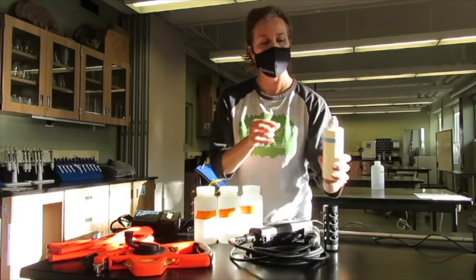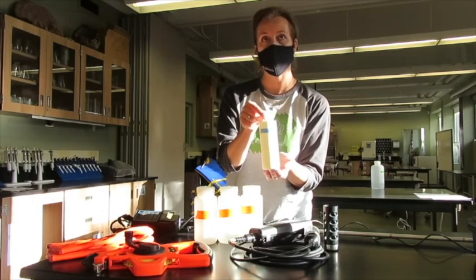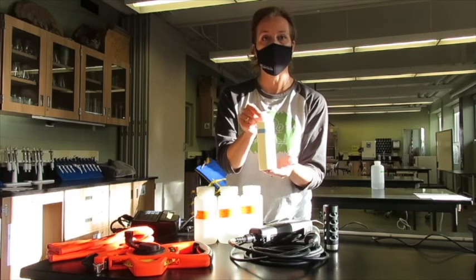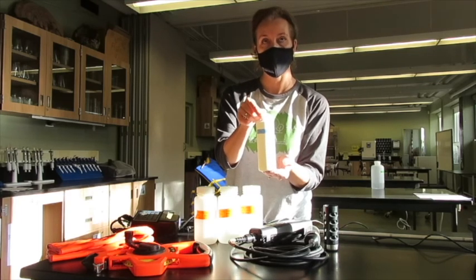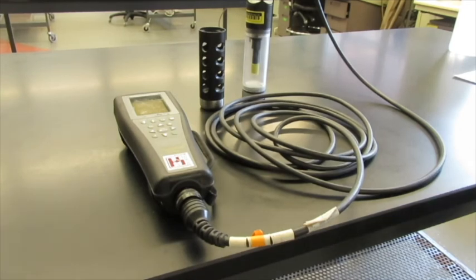Here is the protective cage for those very expensive probes. You always want to bring out a jar of tap water to rinse the probes after each sample. Before using the YSI ProPlus multimeter, we need to calibrate dissolved oxygen before every usage, before going out into the field.